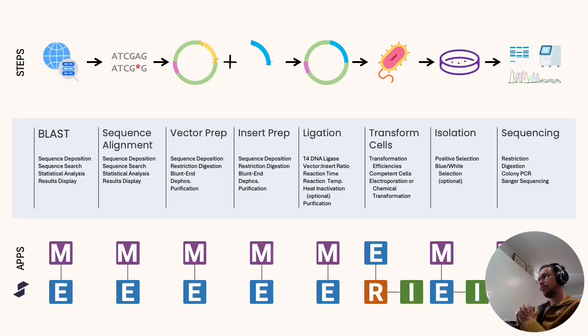Coming back to our molecular biology workflow slide, what I'm showing right now is a third panel on the very bottom that indicates what kind of apps we anticipate working with each other at each of these steps. And of course, this is not an exhaustive list. This is simply a quick summary of what we think right now might be the case in our current platform.